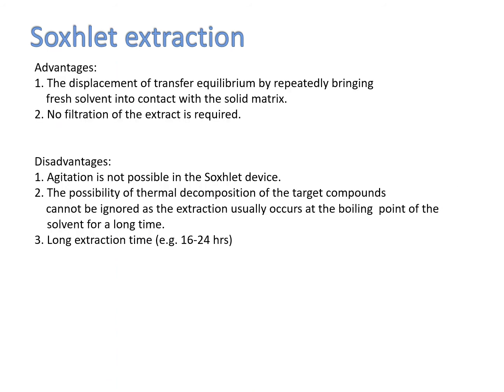The advantage of this extraction is the displacement of the transfer equilibrium by repeatedly bringing fresh solvent into contact with the solid matrix. No filtration of the extract is required. But the disadvantage is that agitation is not possible, and the possibility of thermal decomposition of the target compounds cannot be ignored, as the extraction is performed at the boiling point of the solvent for a long time, and the extraction time is quite long, which is not very convenient, class.